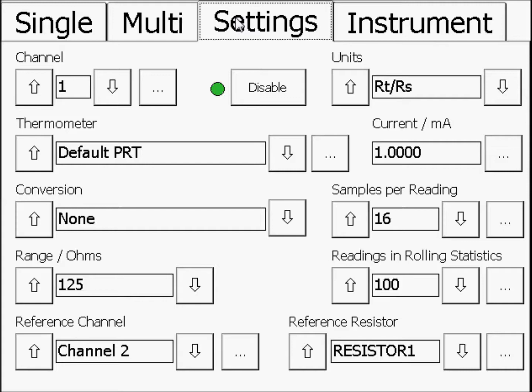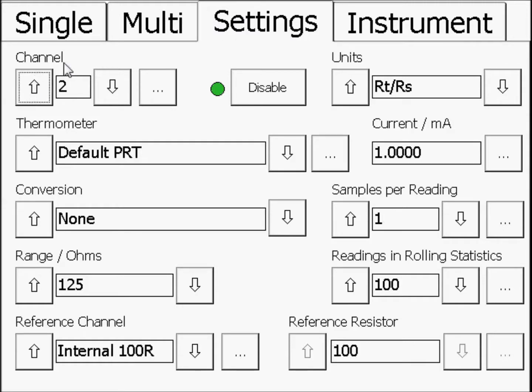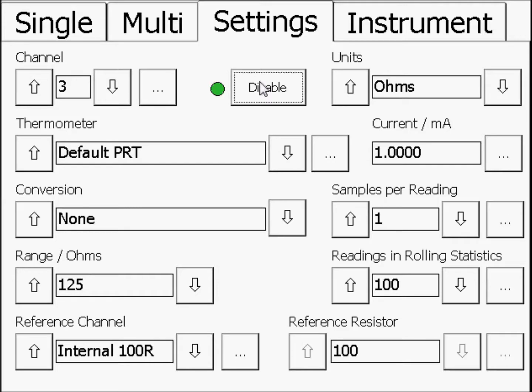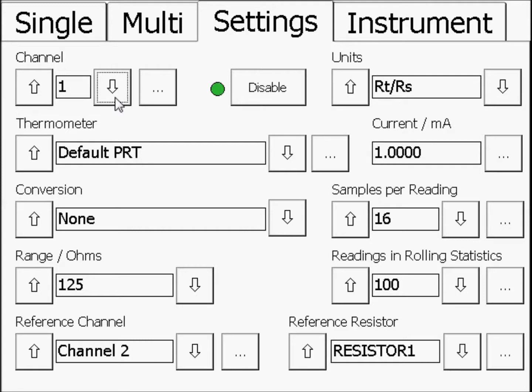Use the arrow buttons next to the channel box to select channels 2 and 3 and disable them. This will speed up the measurements on channel 1. Now, use the arrows to return to channel 1 and select the following settings.